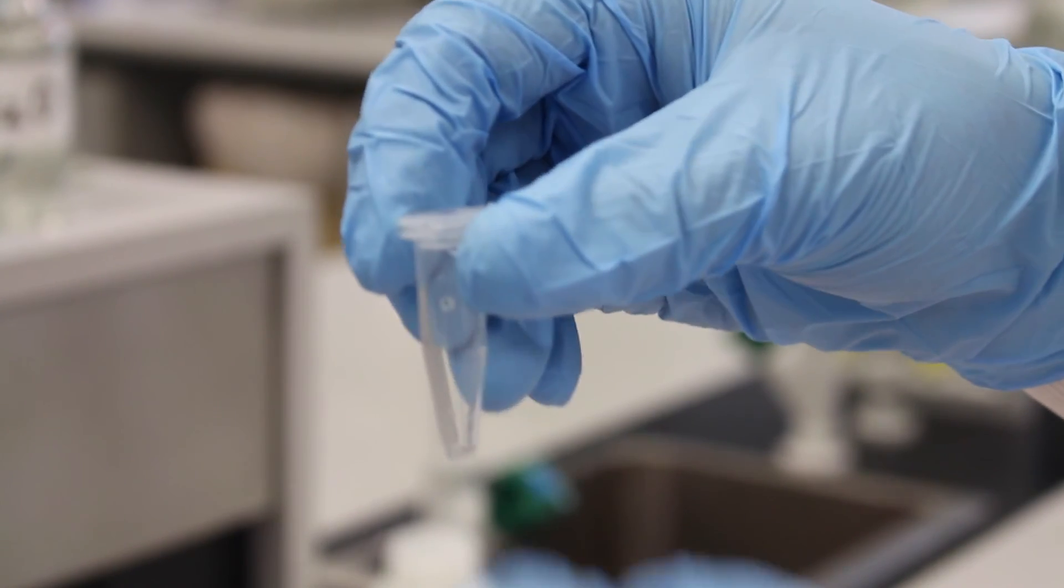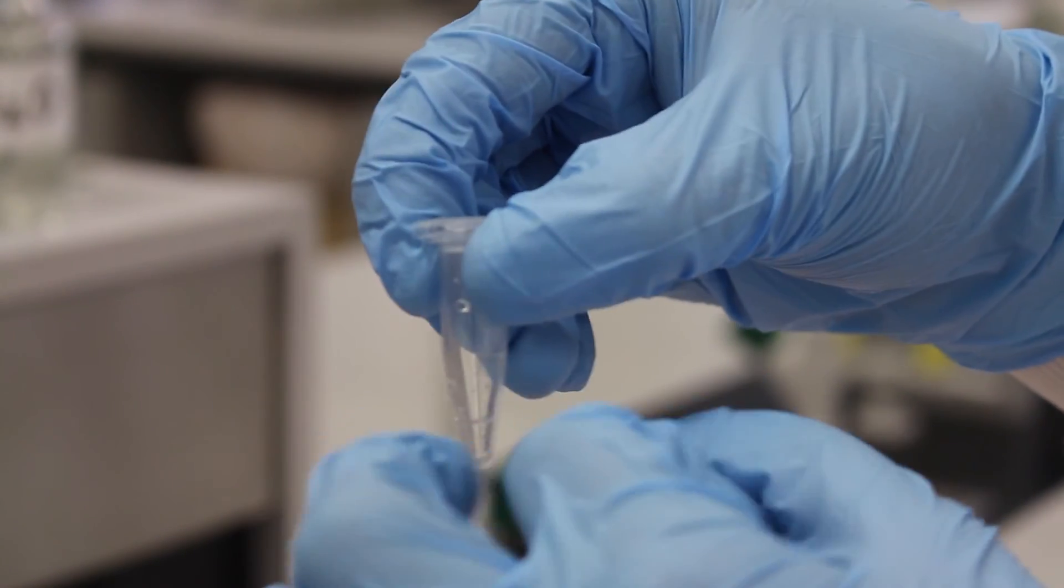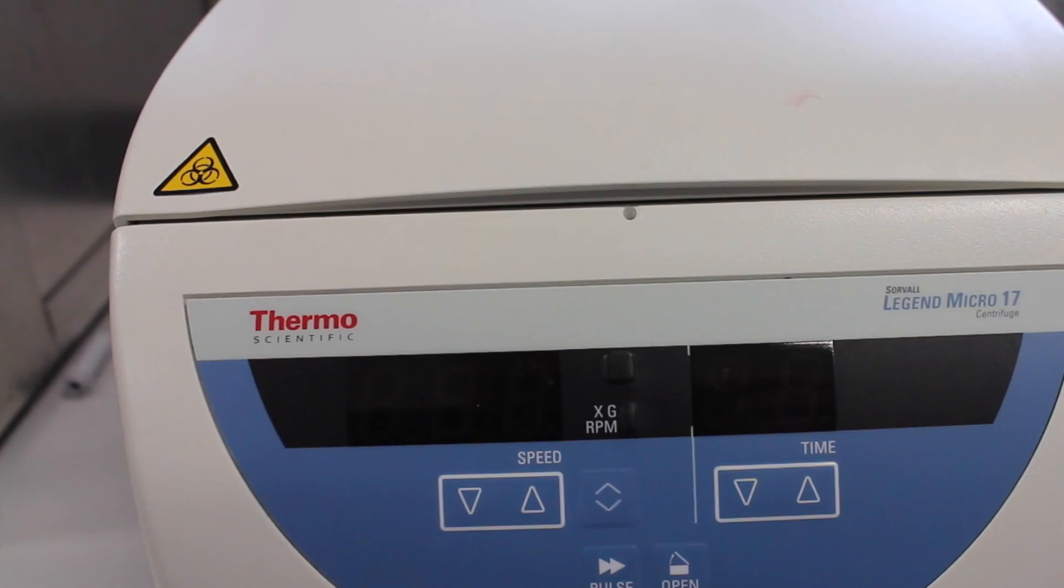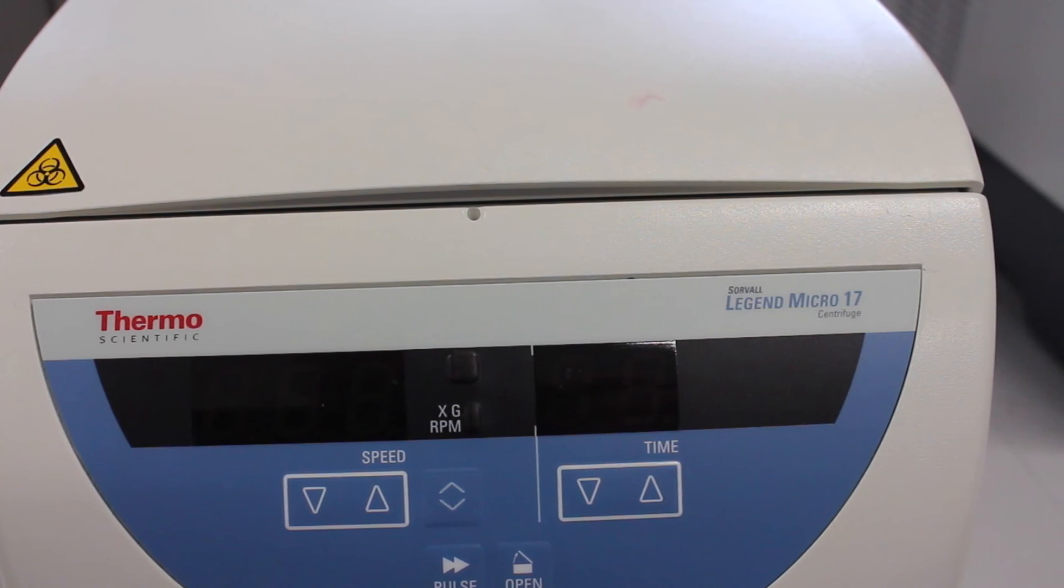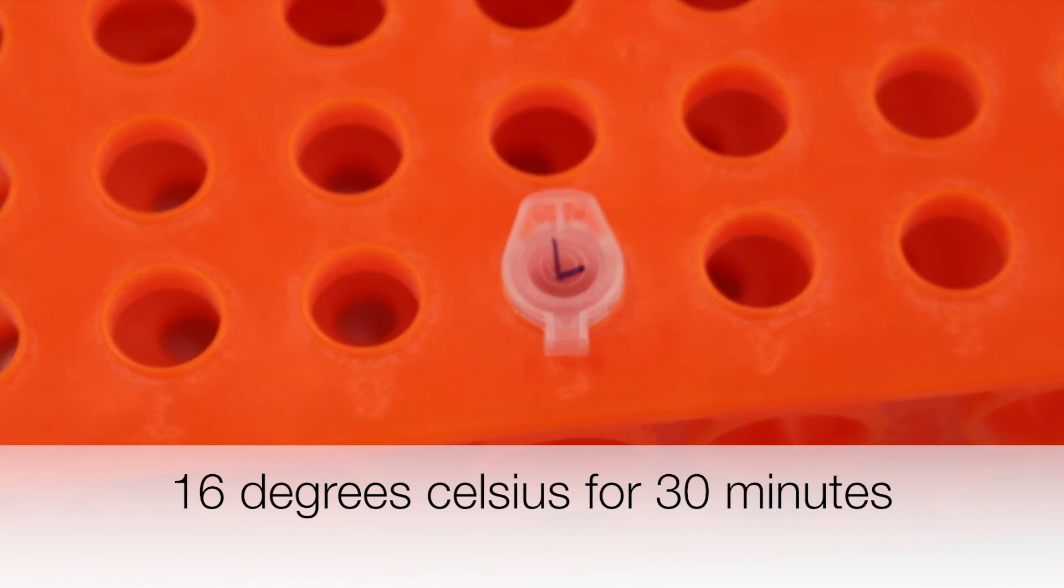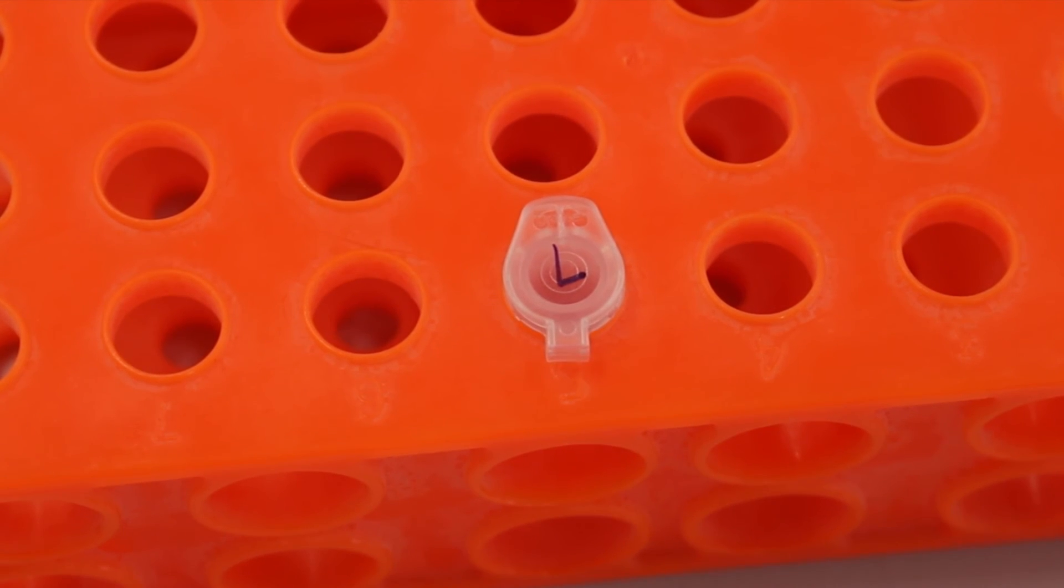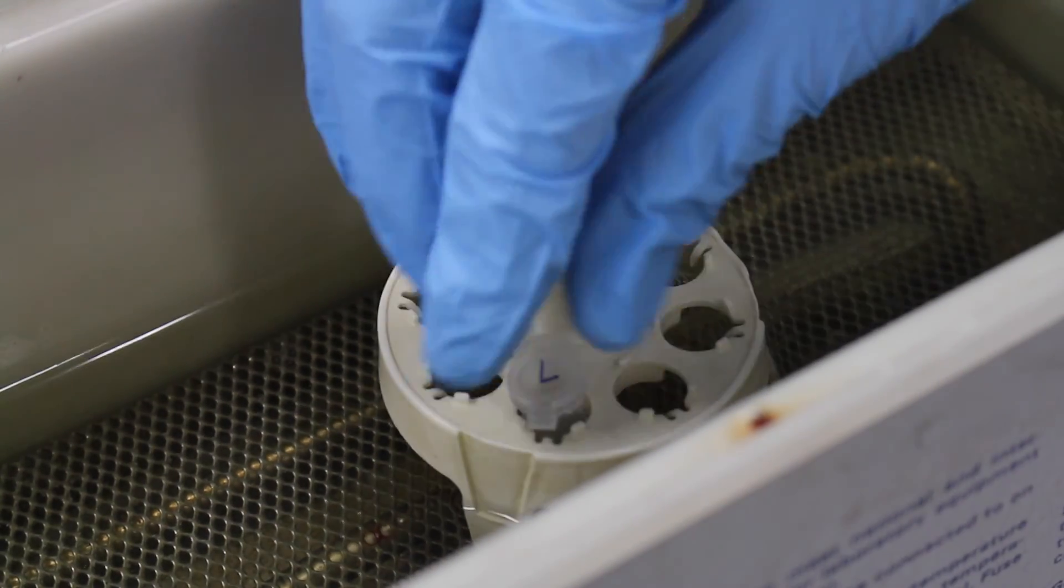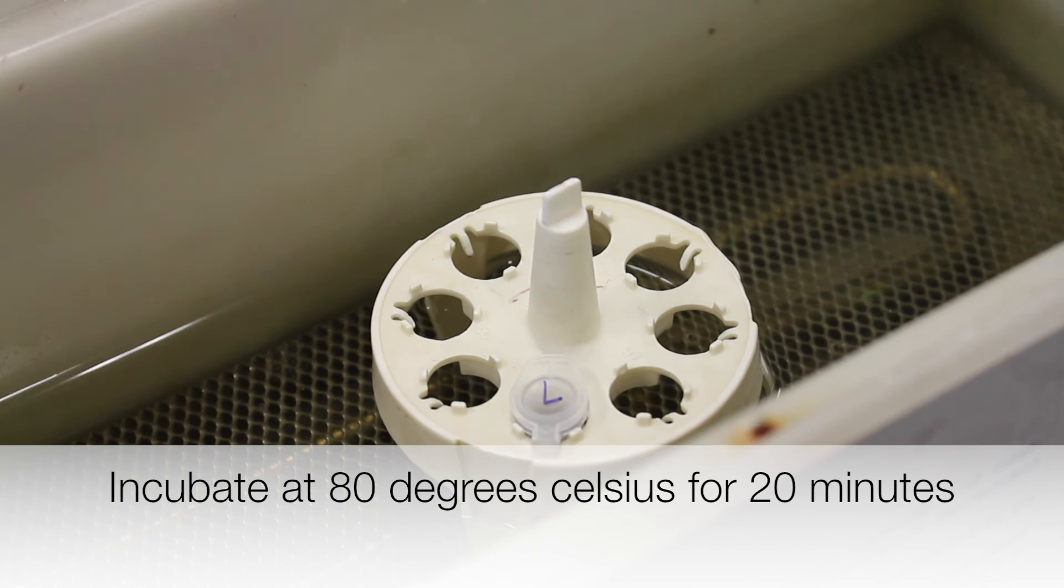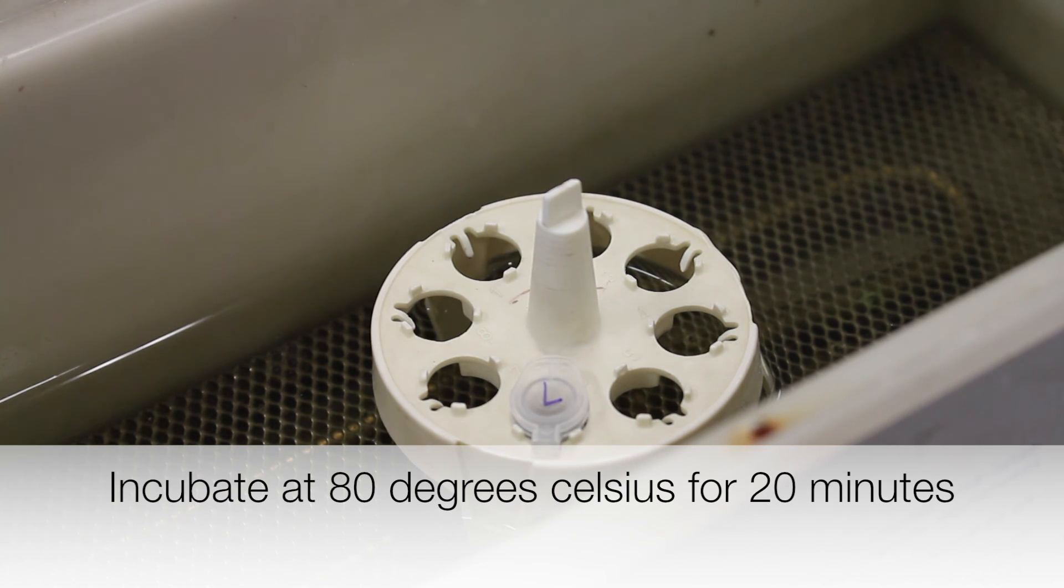The tube is flicked to mix all the contents together. The tube can be spun on a microcentrifuge for a few seconds to collect the liquid in the bottom of the tube. Tube L is left at 16 degrees Celsius for 30 minutes to allow the ligation reaction to proceed. The tube is then placed in a water bath at 80 degrees Celsius for 20 minutes to denature the enzyme.